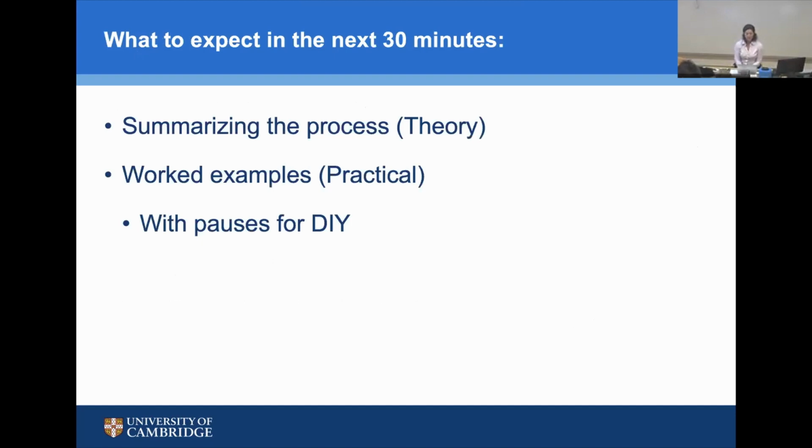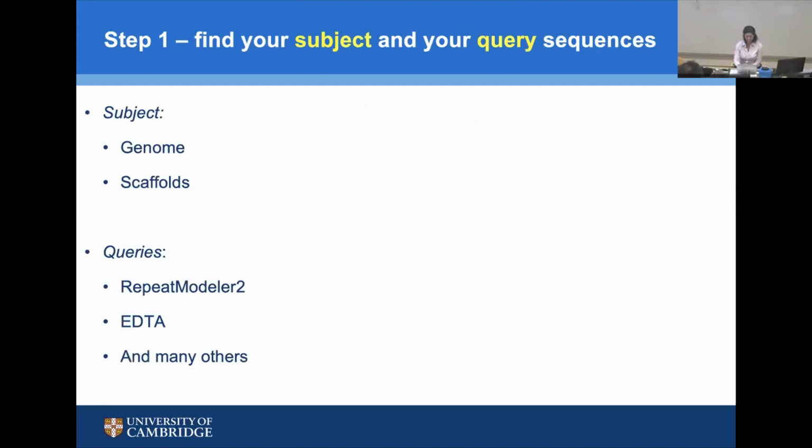Right, so in the next few slides, I'm going to summarize the process of what our proposed pipeline does. And then I'm going to do some worked examples, including some very basic Unix commands. So if you were puzzled before, fear not, you'll be taking one step at a time.